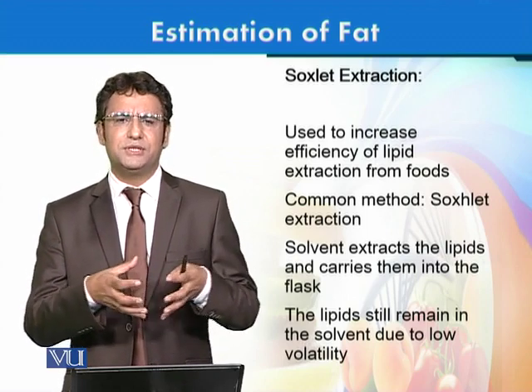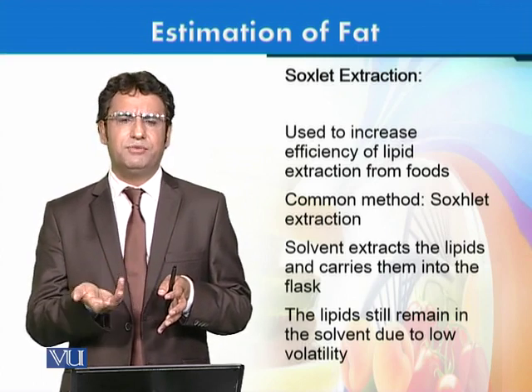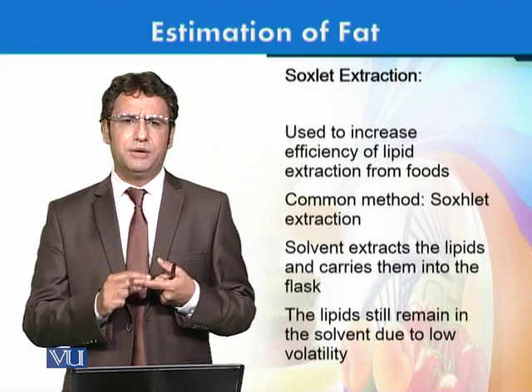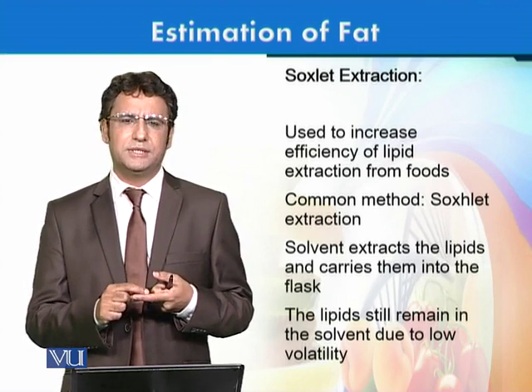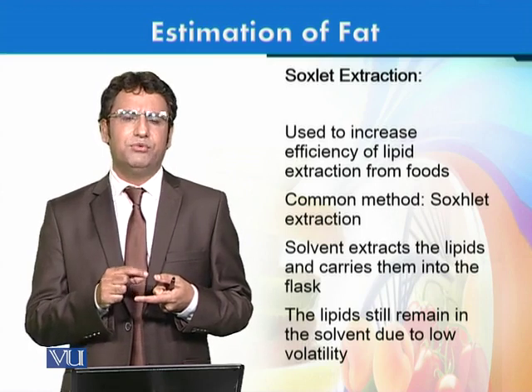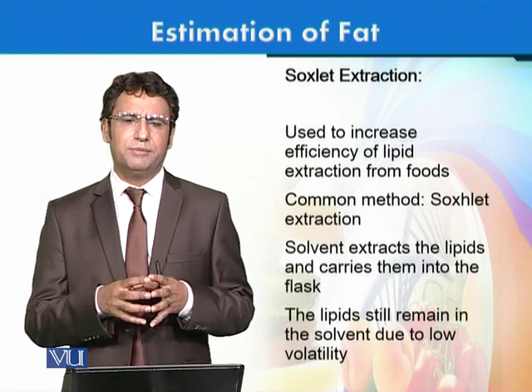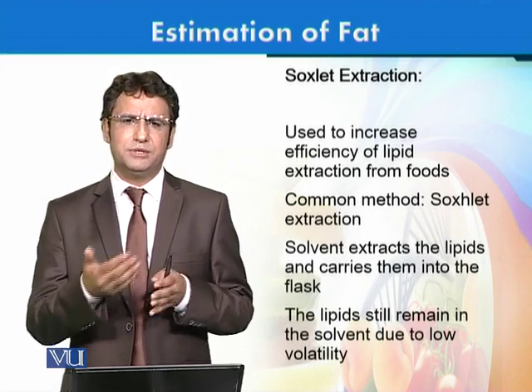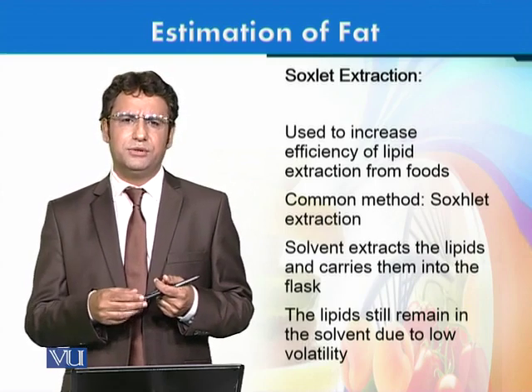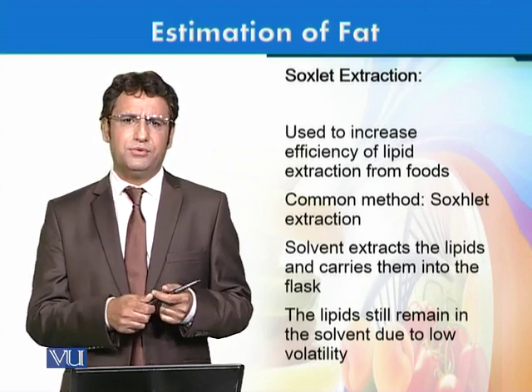Once we are left with this solvent and fat in the flask, then we evaporate off that solvent, and the remaining amount of fat in the flask is measured gravimetrically, and that would tell us the amount of fat that was present in the food. So that can be determined, and this is how we do fat analysis, total fat analysis, for different foods.